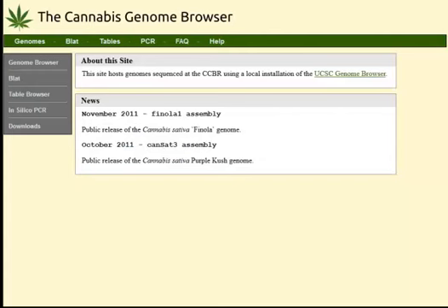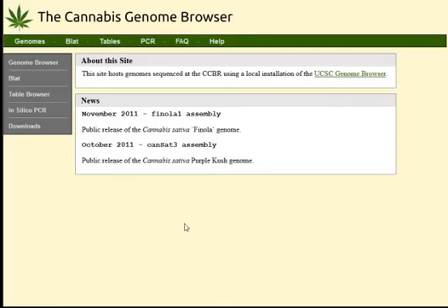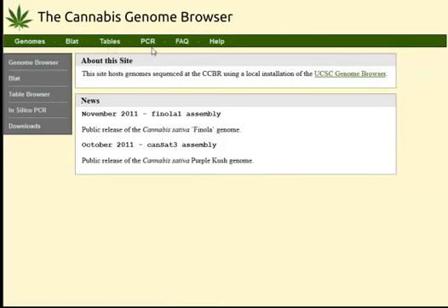You can find that browser hosted at the University of Toronto — the Cannabis Genome Browser. When I first arrived I was delighted to see this as a UCSC Genome Browser software installation. What that means is that we have freely available training materials that will help you understand how to use the software features. You can explore the genome, do a sequence search, query the tables for the underlying data, and perform in silico PCR. There are a lot of different things you can do with the genome browser based on the UCSC Genome Browser tools.